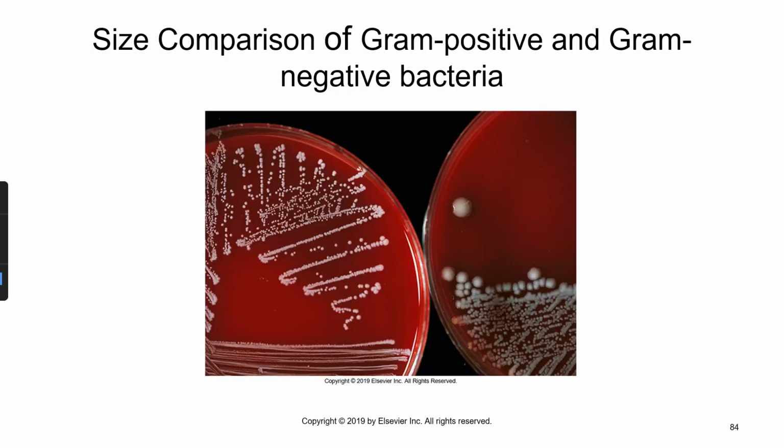So here you can see the size comparison between gram-positive and gram-negative. Of course, there are exceptions, but in general, the gram-positives are going to be more of the pinpoint bacteria, while the gram-negatives are going to spread out more and grow thicker on the plates.